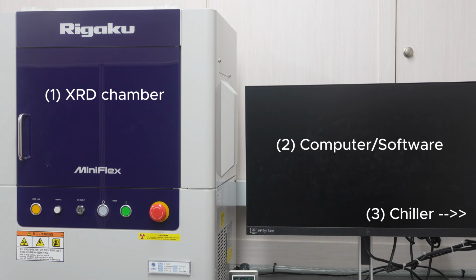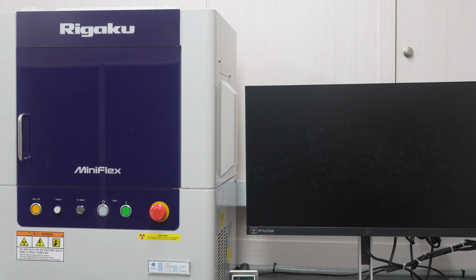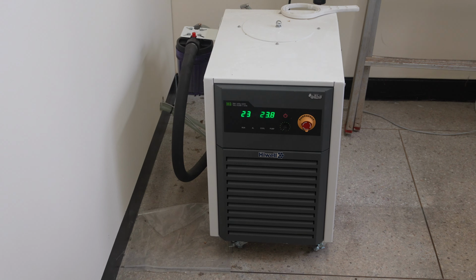So there are three main parts of the X-ray diffraction machine. First is the XRD chamber, second is the computer and the software, and the third one is the chiller. This is the chiller. The chiller is very crucial in maintaining the optimal temperature during the analysis, ensuring precise and reliable results. What we need to do is just press the power button here. After that, we need to wait for about 15 minutes before we turn on the X-ray light or the X-ray generator.